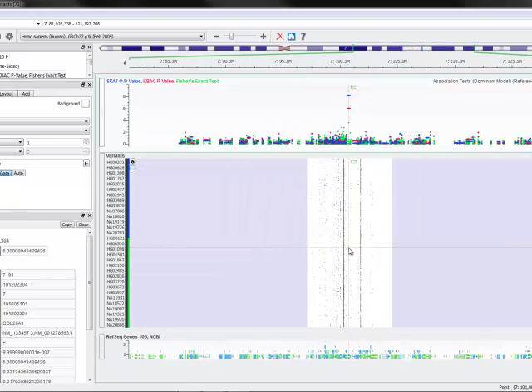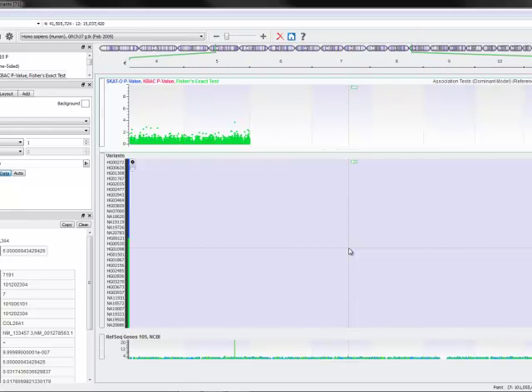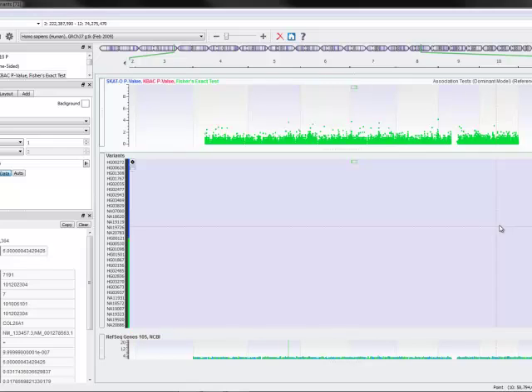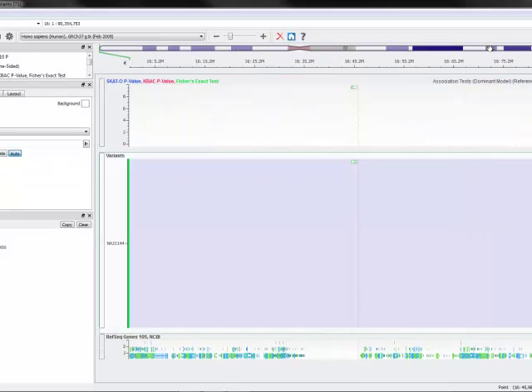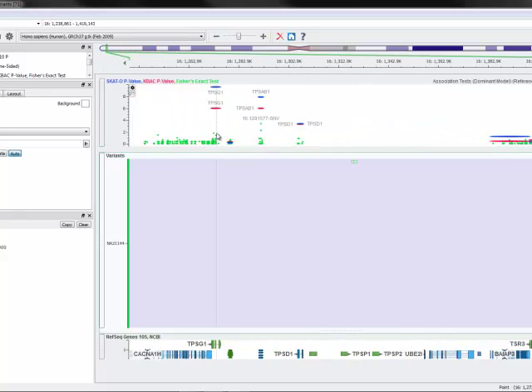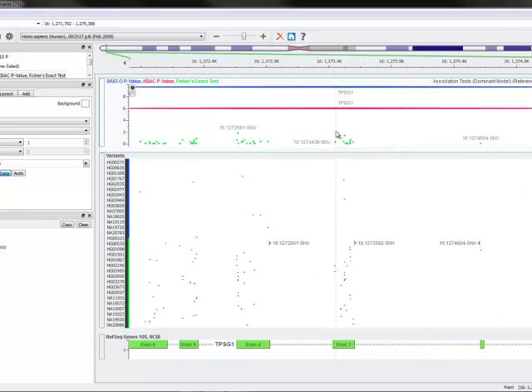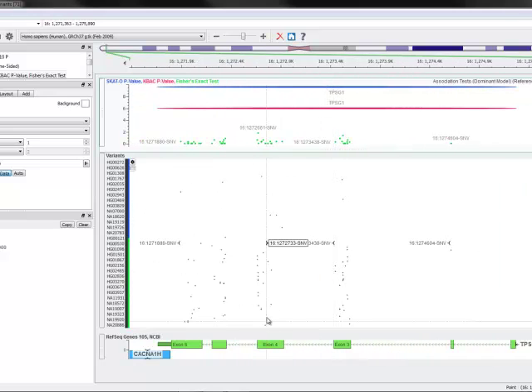And as we look at some of the other results around the exome, we'll see a similar pattern. If we move back over to chromosome 16, where we were looking earlier, at TPSG1, here we see essentially the same pattern we saw with our simple burden test that we put together a moment ago, where we can see the results of the collapsing tests together with the results of the SNP by SNP tests and recognize the variation pattern that drives it.